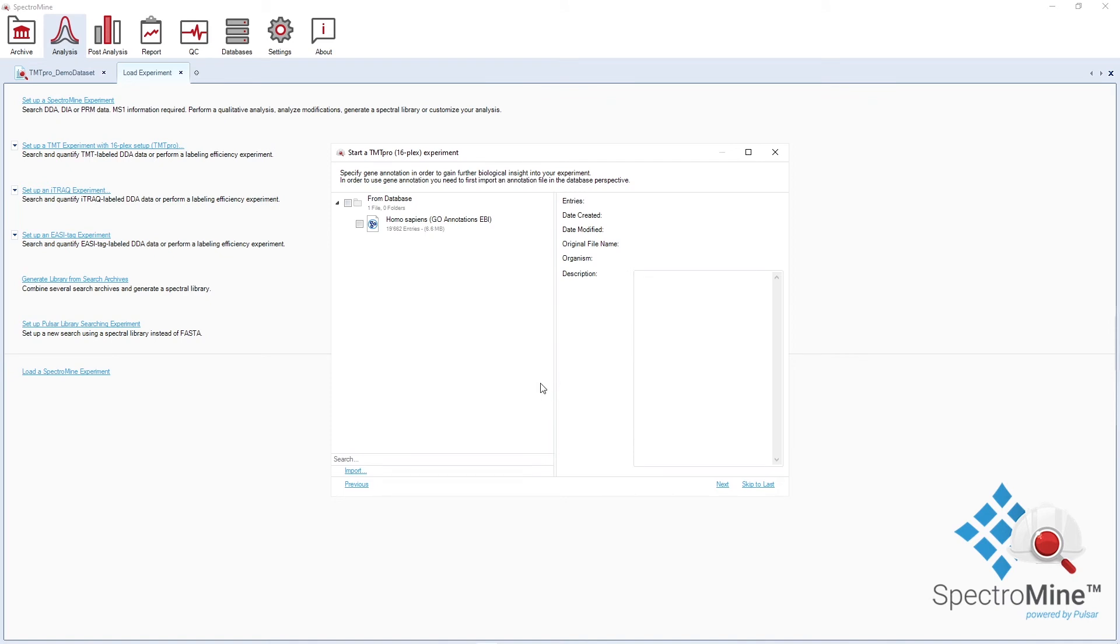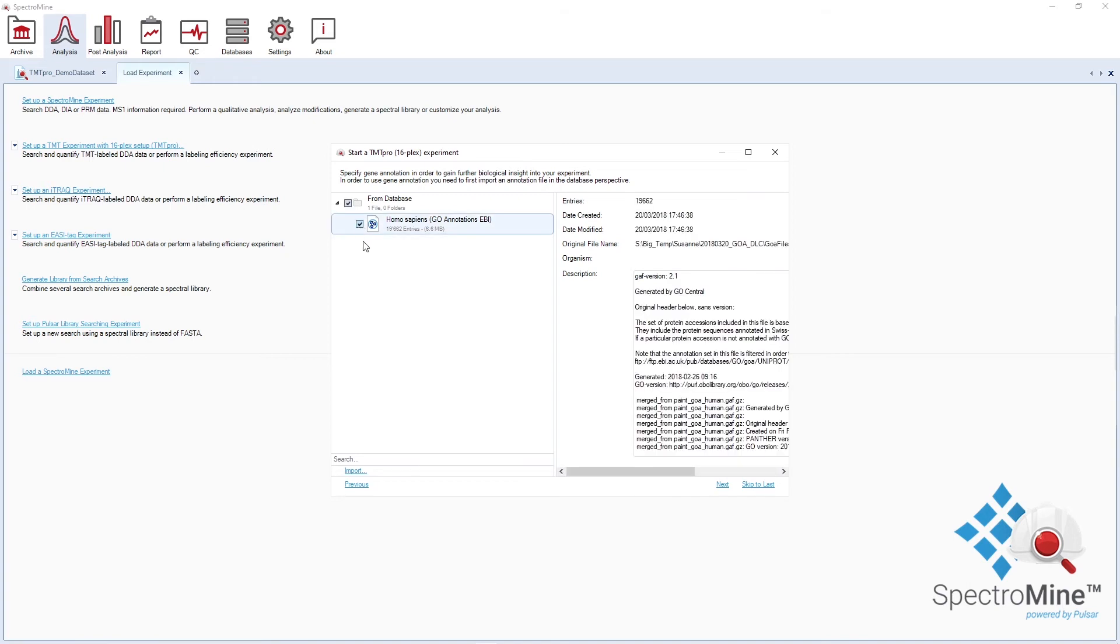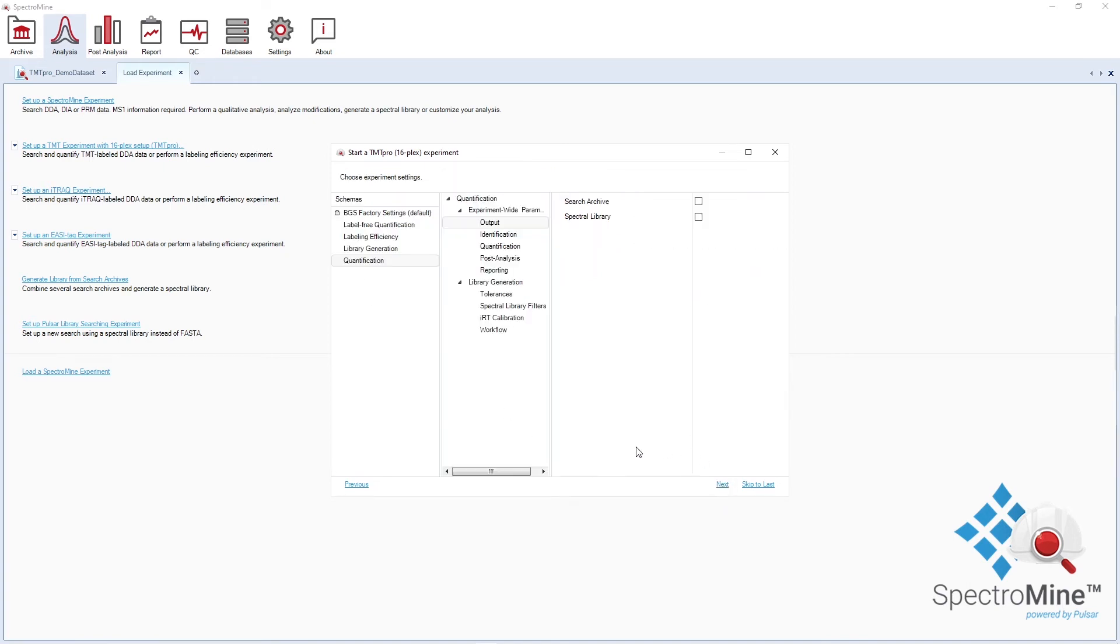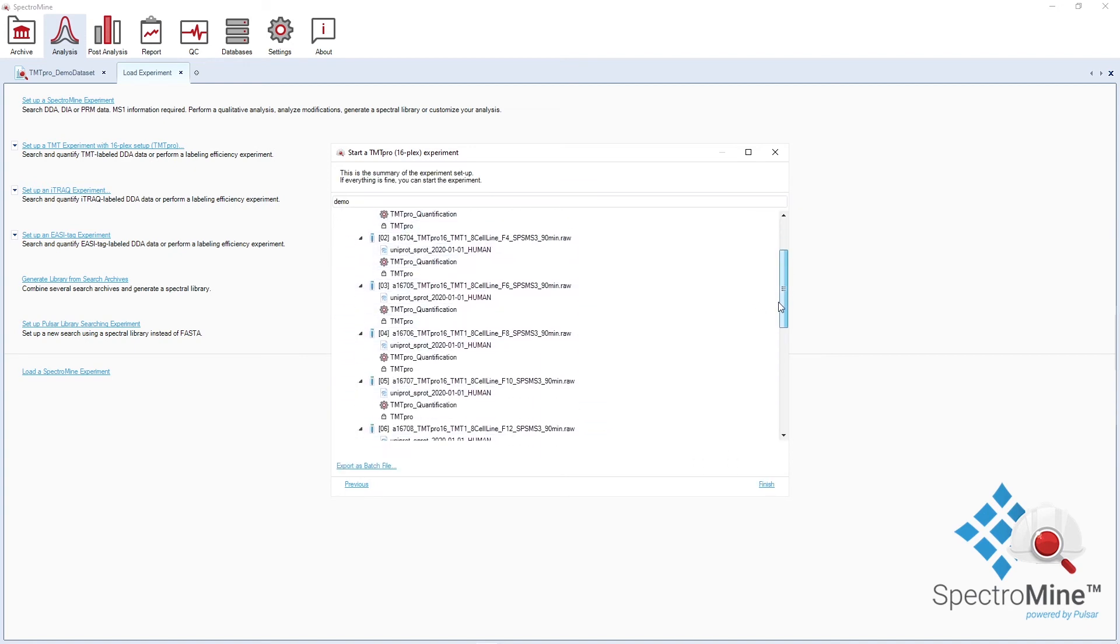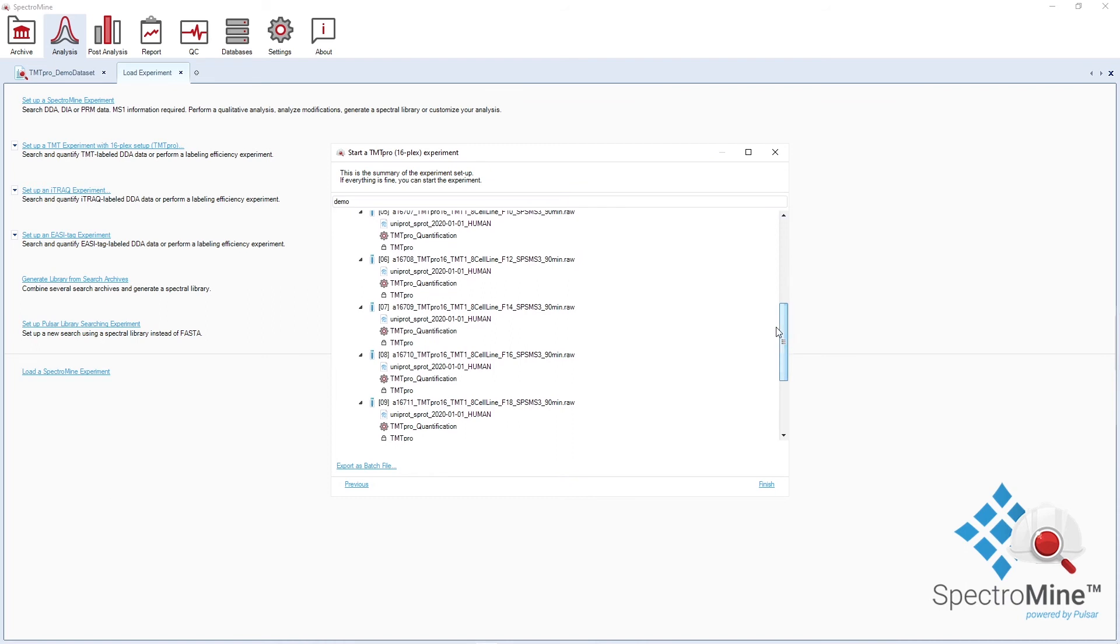In the next window, you can also assign, in case you perform gene ontology enrichment analysis, you can assign your gene ontology annotation file. Finally, you choose the experiment settings based on your workflow. In our case, it will be quantification. This is the summary of your analysis. You can have a final check and if you're good with it, you can click on finish and start the analysis.